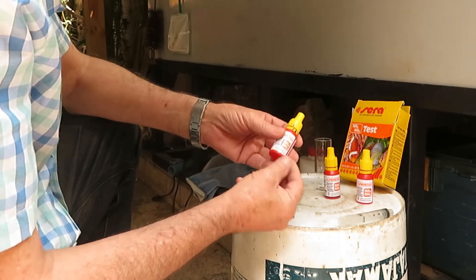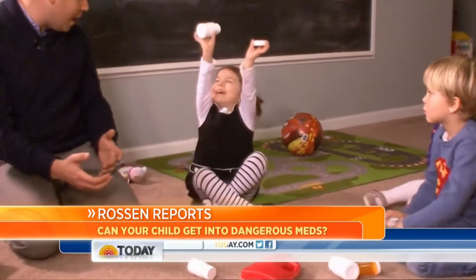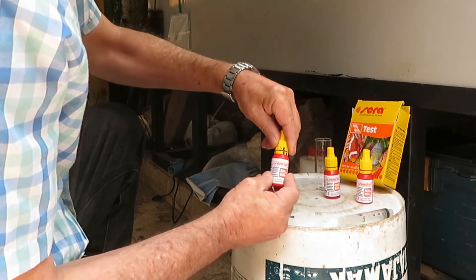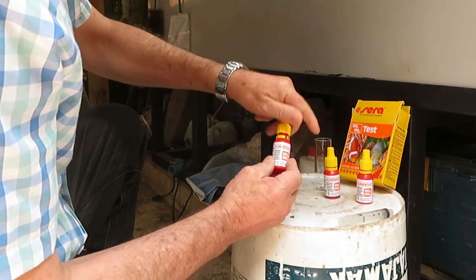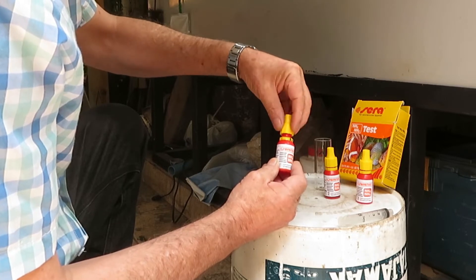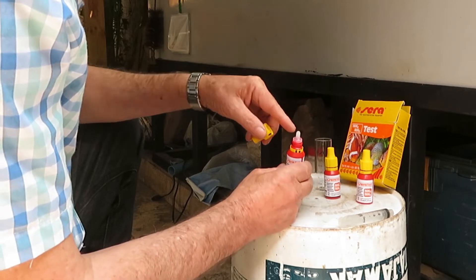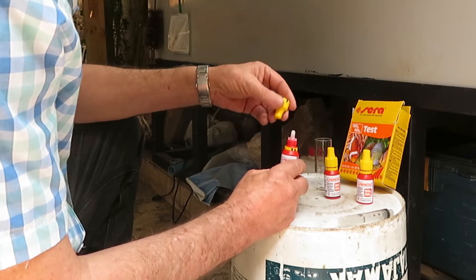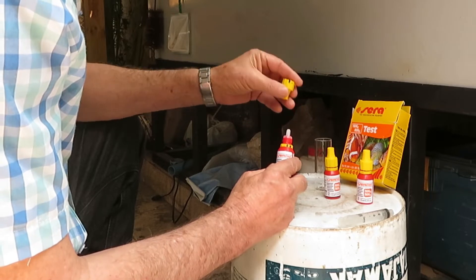For those who don't know how to open these caps, you push the cap down while turning it counter-clockwise, and that brings the cap off. Also, the dropper of these bottles is sealed, so you have to puncture it with the cap to be able to get the drops out.